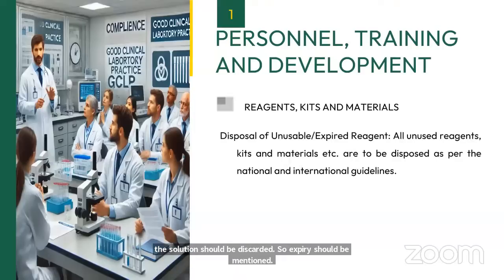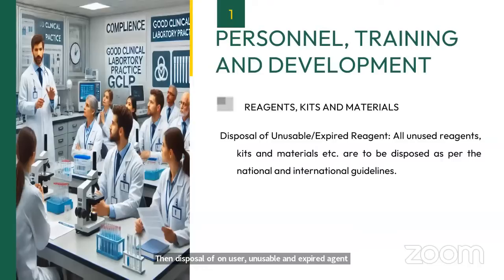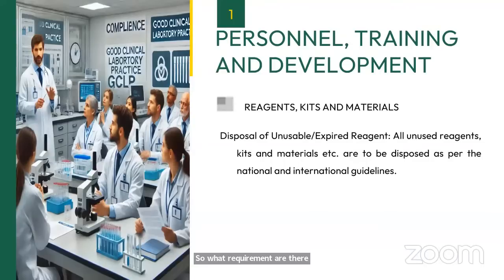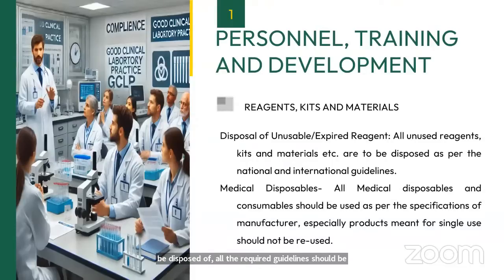Then disposal of unusable and expired reagents should be as per the national and international guidelines. When you open the reagent, there is a package insert, so it mentions how to dispose of that reagent and chemical. So it should be discarded as per those requirements. If there are certain radioactive materials, how they should be disposed of. If there are certain carcinogenic materials, how they should be disposed of. Whatever requirements there are, such as formalin and xylene in your histopathology laboratory, how they should be disposed of. All the required guidelines should be followed as per the national and international regulations.